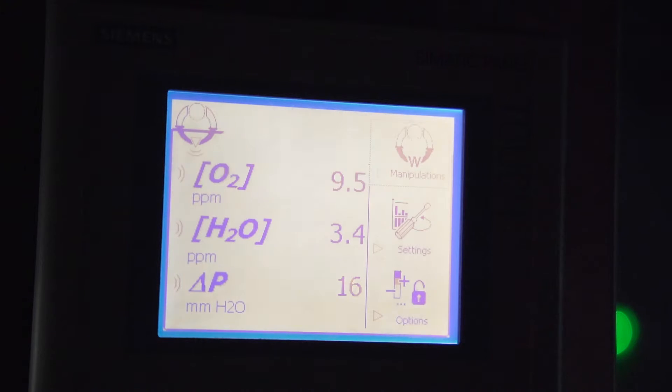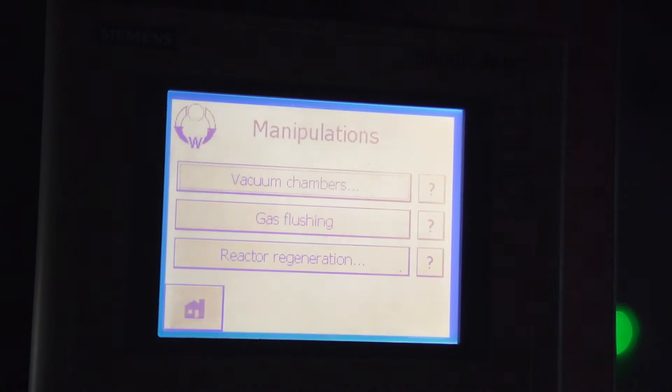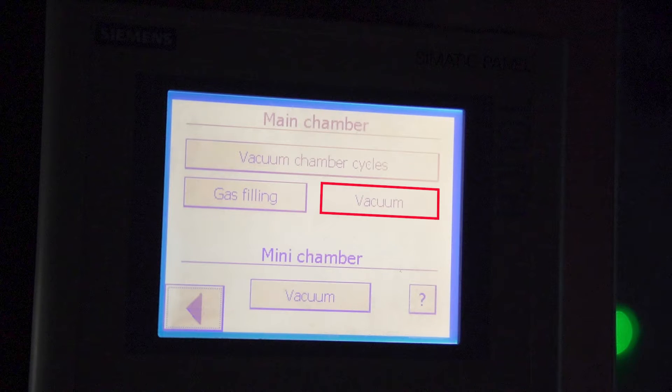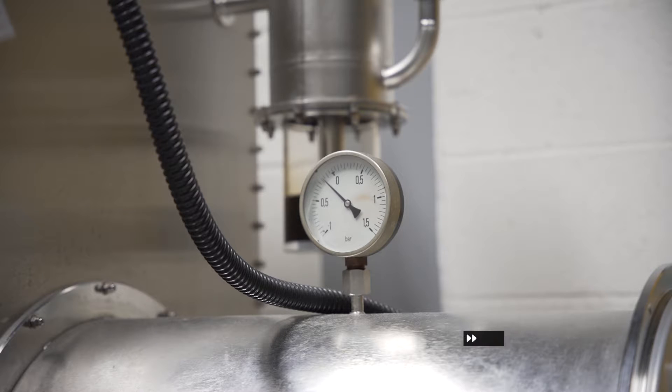Always evacuate the chamber after handling in the glove box or after removing or entering equipment. Press manipulations, vacuum chambers, main chamber, vacuum. Once the pressure displayed on the needle gauge is minus 1, press stop.